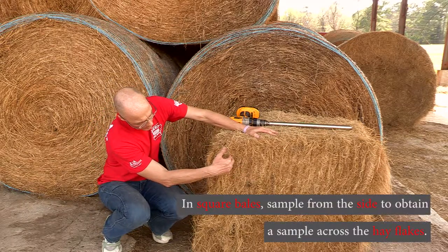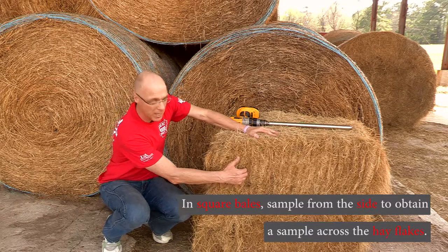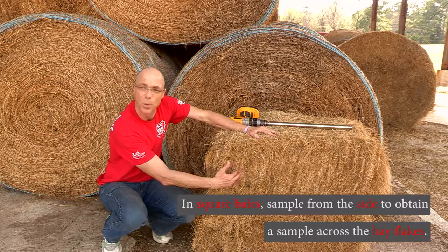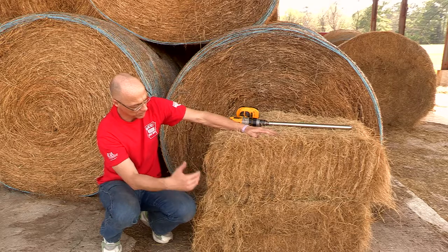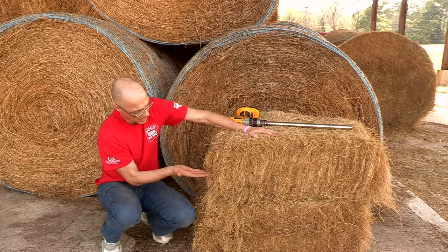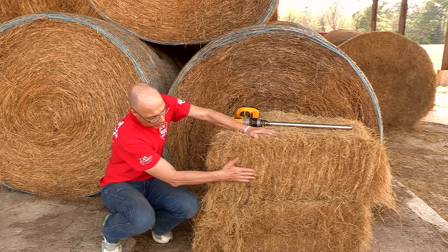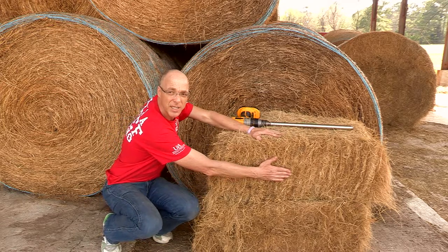When taking samples from a square bale, sample from the end side. Square bales have flakes pushed through by the baler, which are representative of the forage in the windrow. Never drill into the flat surface, as you'd only get a single flake. Sampling from the end gives you a core across the entire length of the windrow assembled in the field.